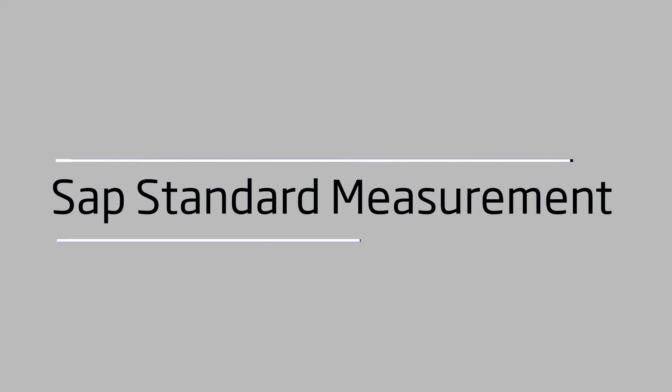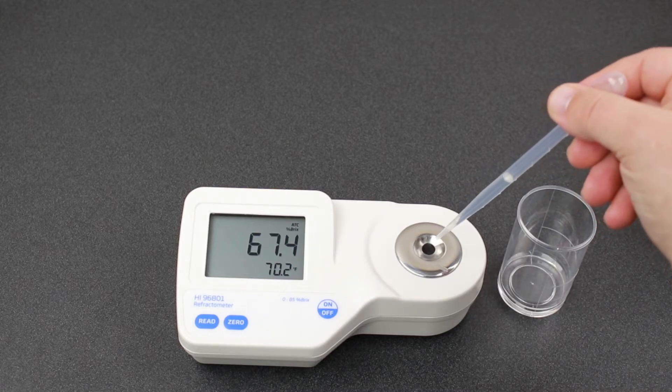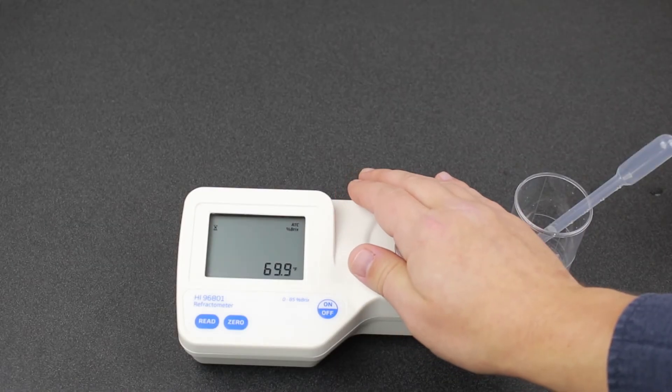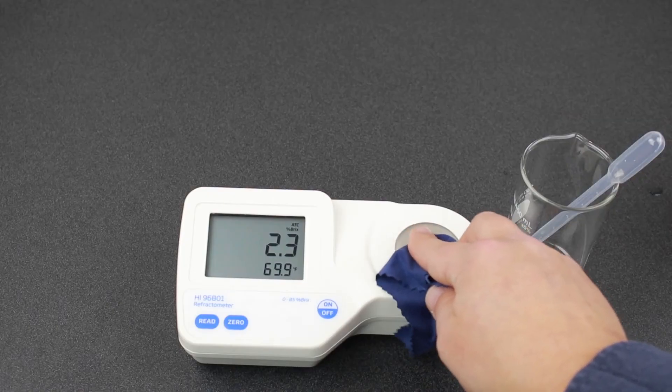Next we'll measure our sap standard. It's best to take your sap measurements inside where it isn't cold, but if you are measuring outside, be sure that your device is level and your sample is at a stable temperature. Completely fill the well with sample, cover the well with your hand to prevent any stray light, and press read. When finished, to make rinsing easier, put some DI water on the sample and dry with your microfiber cloth.